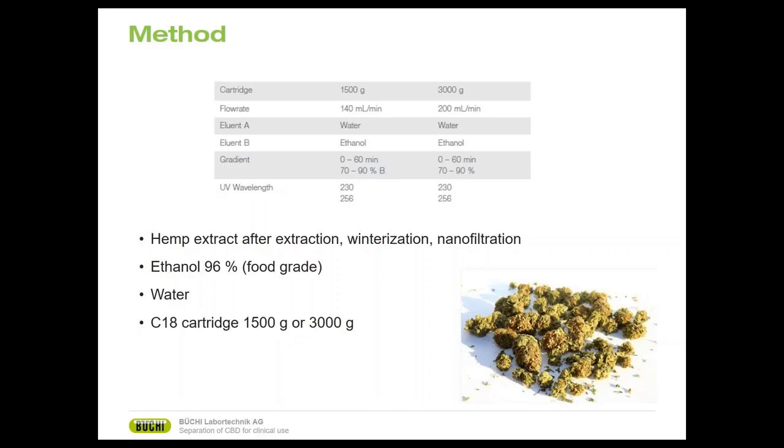And in this case, over the gradient from 0 to 60 minutes, your gradient goes from 70 to 90% B. B is the ethanol concentration in this case. So you can easily see both methods are 60 minutes, but with the bigger cartridge, you can run more samples.